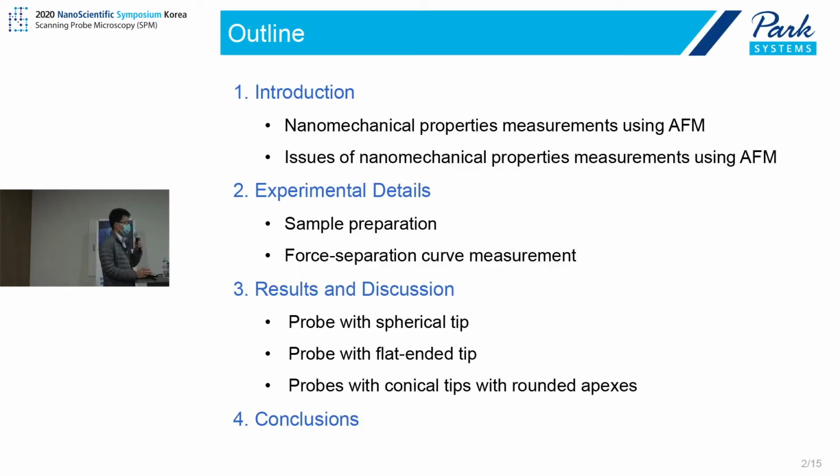This is the outline of my talk. I will first give a brief introduction about the nanomechanical properties measurement using AFM and related issues. Then I will move on to the experimental details. In the third part of my presentation, I will discuss the measurement results obtained using 4 different tips. Finally, some concluding remarks will be made.